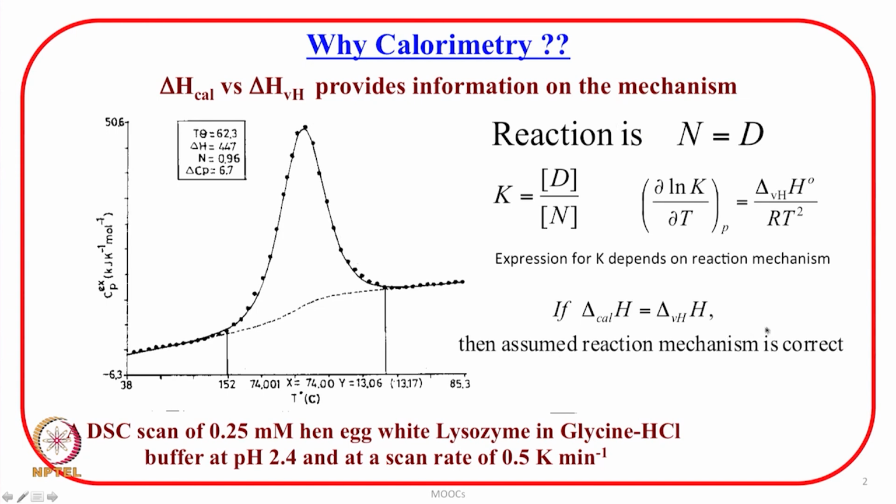So, this equivalence of calorimetric enthalpy and Van 't Hoff enthalpy for a reversible two state mechanism by this argument establishes the mechanism of the reaction.